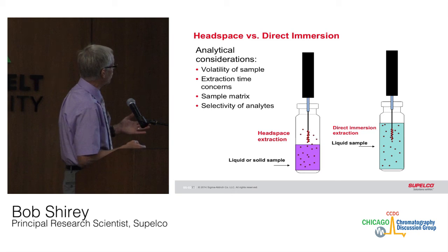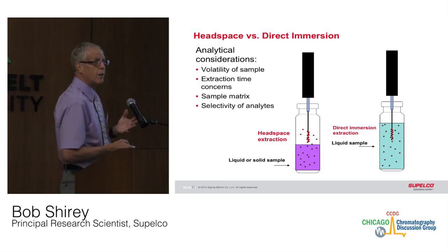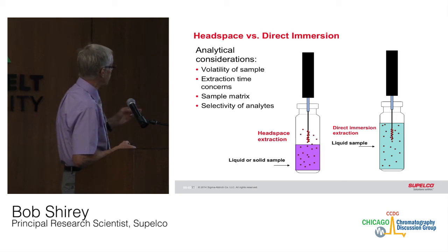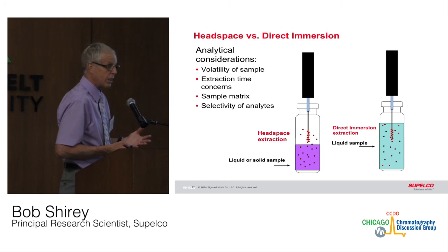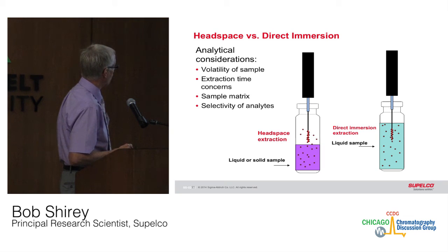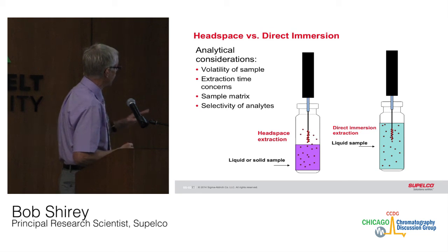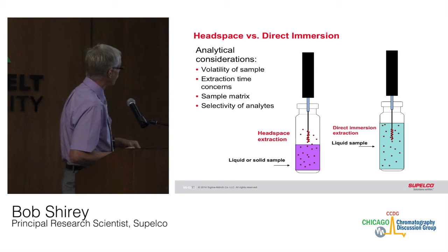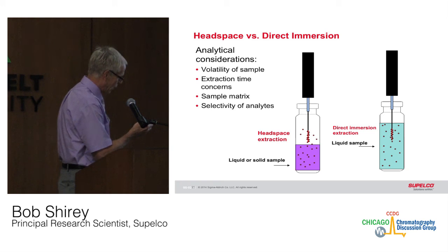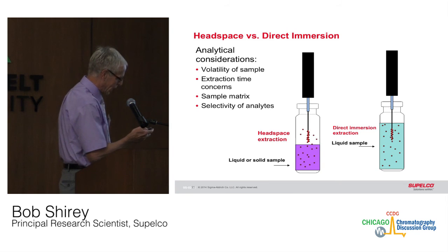Headspace versus direct immersion, of course, that's dependent upon the volatility of the sample. It must have at least some vapor pressure to be able to do headspace extraction. Extraction is faster in the headspace than it is by immersion, because the analytes will move faster through air than they will through a liquid. And of course, it's matrix dependent. We can't immerse a fiber into a solid. And it does play a role in selectivity. You can fine tune which analytes you want to extract and exclude.